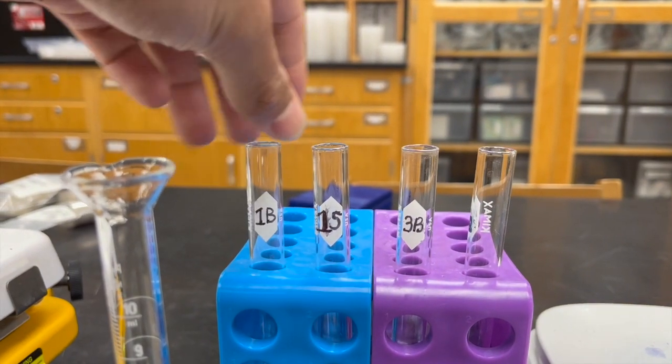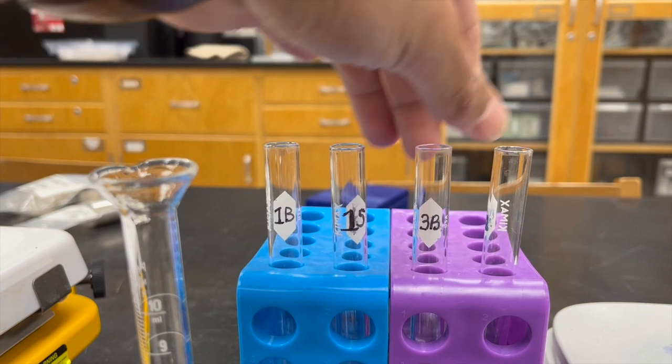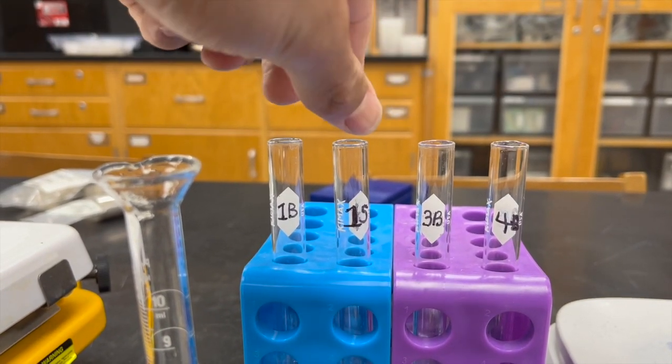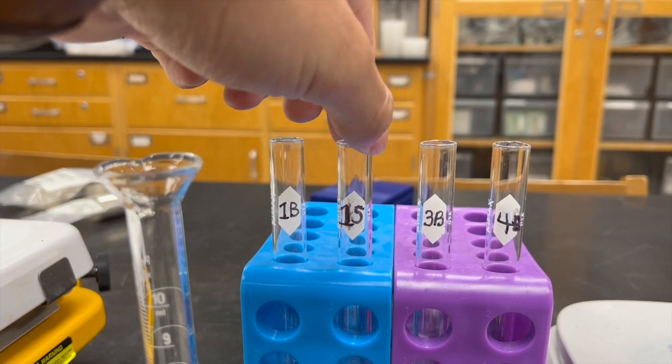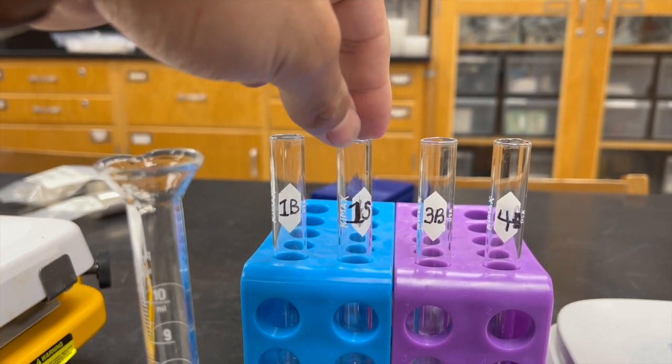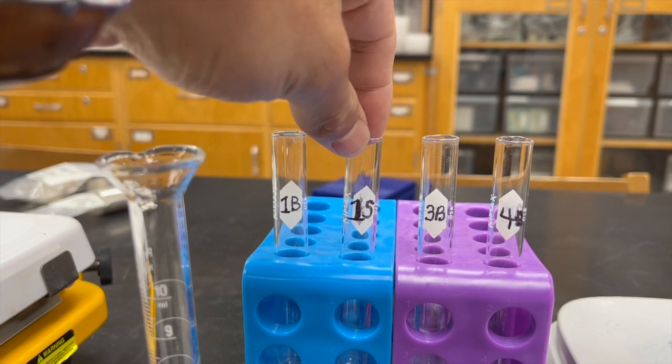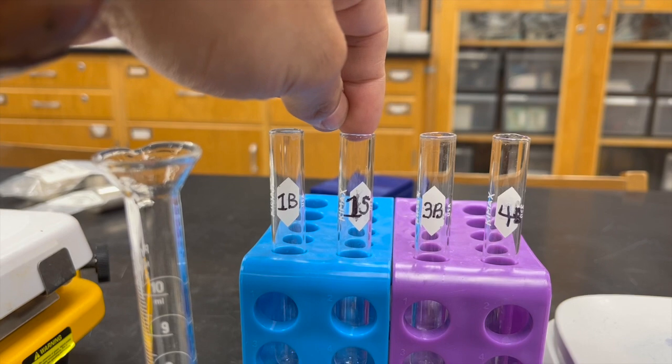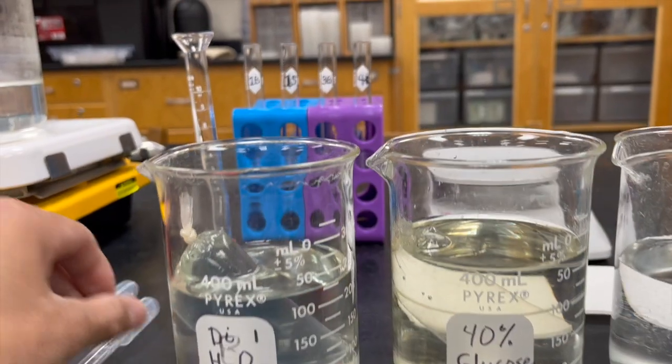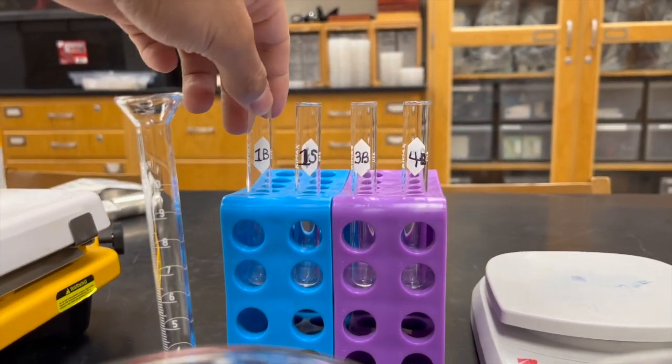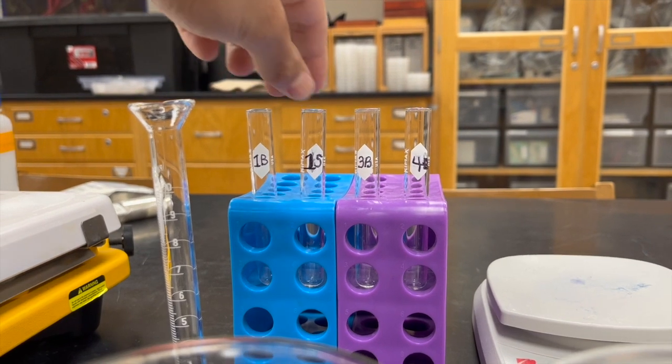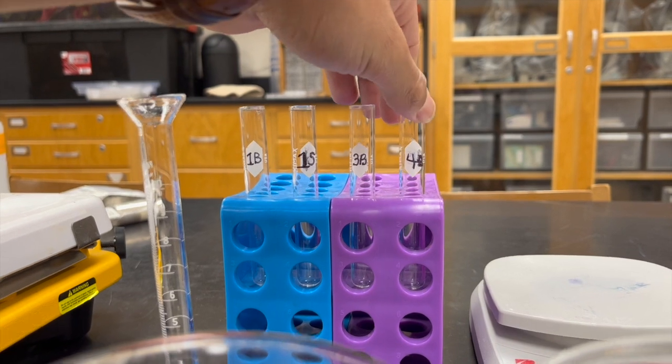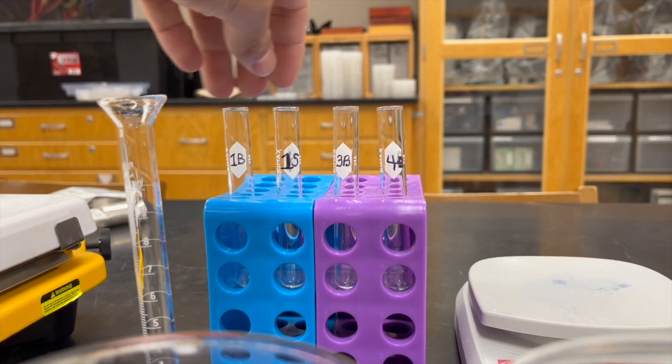So it says 1B, 1S, 3B, and 4B. The B stands for beaker and the S stands for the sack. For 1S, you're going to have to cut the sack and pour some of that into this test tube. For 1B, 1S, as well as 4B, you should pour about 4 drops of the Benedict's solution into each of them.